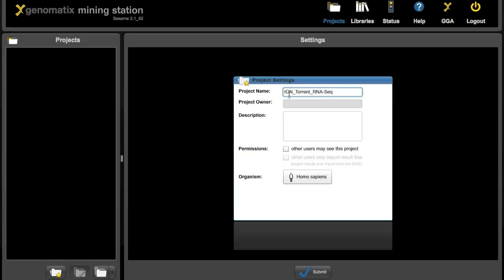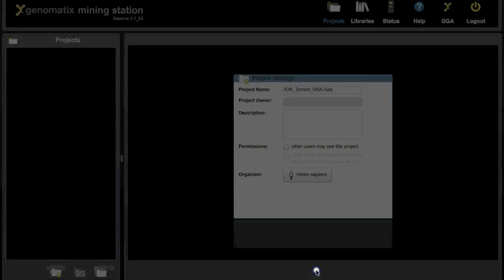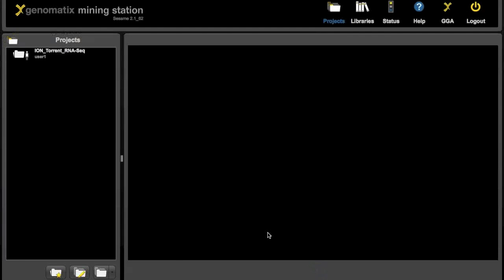Ion Torrent RNA-seq. We could also select if other users should be able to see or export any results from the project. Hit the submit button and there we are. The project is in the projects list.